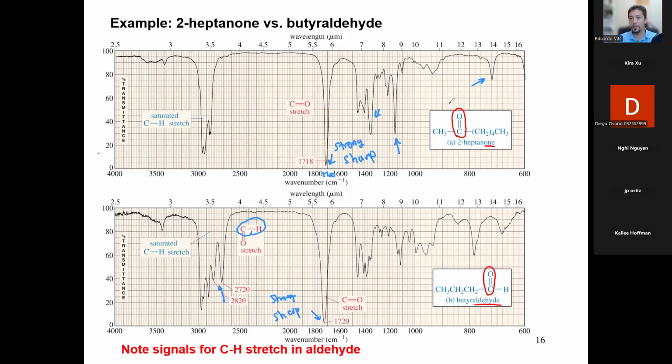So this shows you the difference between a regular ketone and an aldehyde. Yes, you should know how to find the difference based on this carbon-hydrogen peak. Some of the questions you will receive will give you a carbonyl peak, and you'll be like, oh, well, that's obviously just a ketone. Nope, that's wrong. Why? Because you didn't see if there were any other carbon-hydrogen aldehyde stretches. And that only happens with practice. You can only do practice with this, and you get better as you do it.